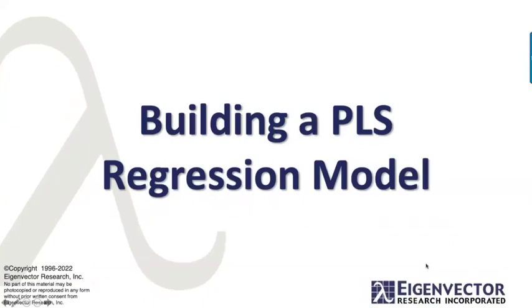And say good morning. Welcome back to a crash course in calibration model development. And so we're really getting into the meat now. We're going to talk about building a PLS regression model. Along the way, we'll talk about a few other regression methods to get us to PLS.